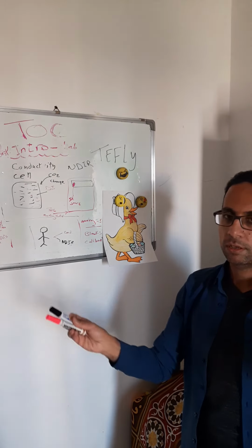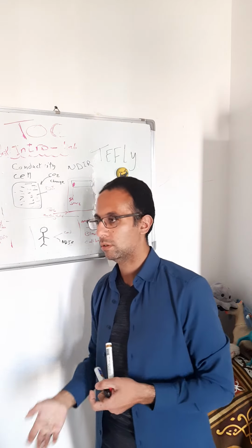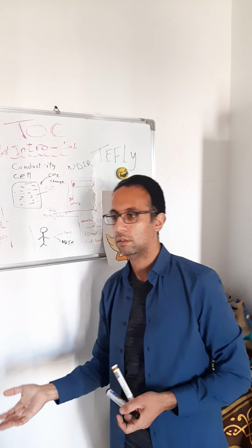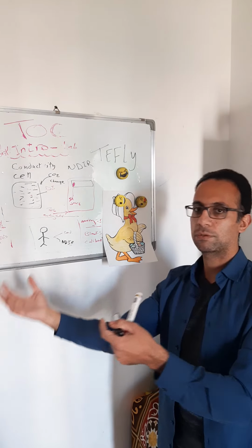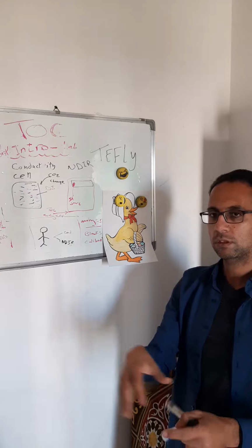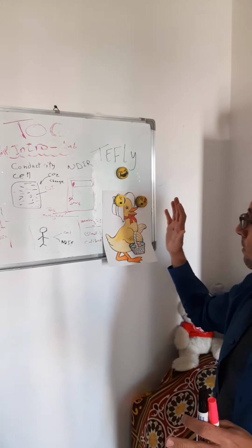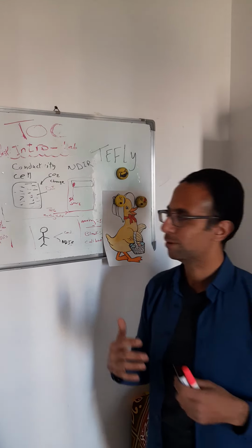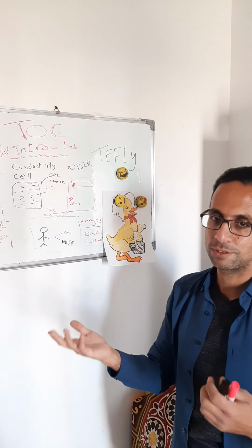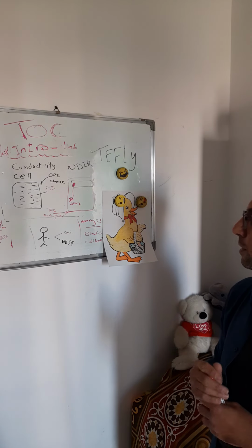There's also more, but I won't go into more details. Some instruments measure TOC directly, some indirectly by subtracting inorganic carbon from total carbon. This will be in other videos. I think this is enough, as it became longer than a quick introduction. So I think it is enough for now.